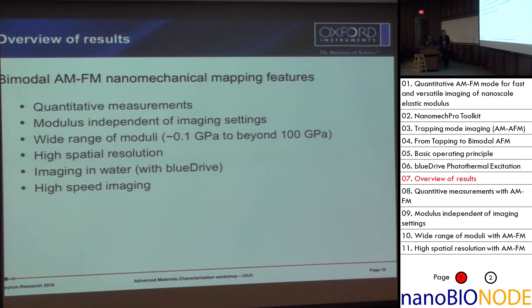I'll jump into the results section. I'll show you some results we got in the last month — some proof that our measurements are quantitative. We did experiments to show that the settings don't change the modulus, which is what you'd expect. There's a wide range of moduli that can be probed, and we have high spatial resolution as well as some experiments in liquid.